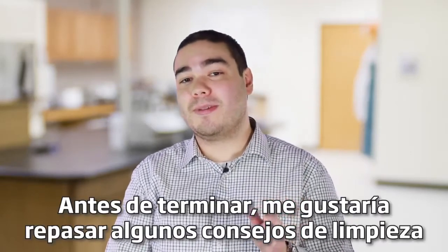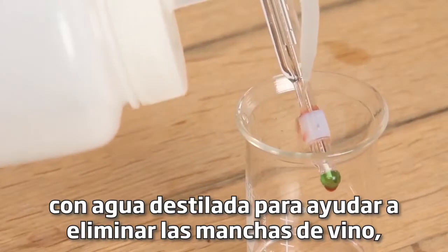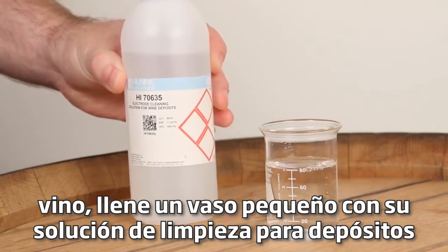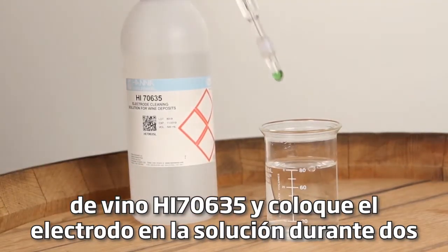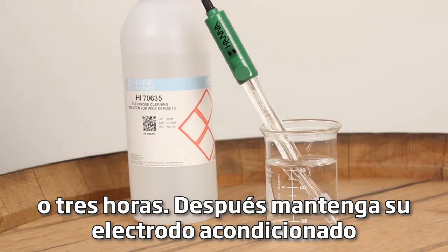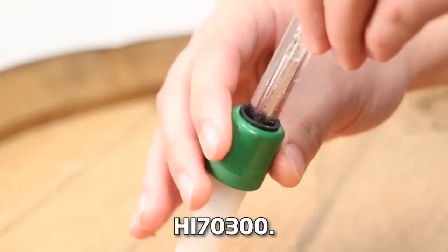Before you go I'd like to go over some cleaning and storage tips. After your measurements, rinse your electrode with distilled water to help remove wine stains. Fill a small beaker with your HI70635 cleaning solution for wine deposits and place the electrode in the solution for two to three hours. After, keep your electrode conditioned by keeping it capped and stored in our HI70300 storage solution.